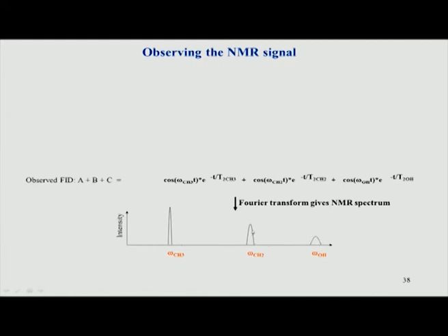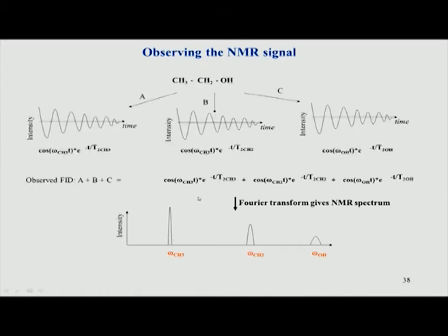And now, this one which is CH2 will be 2 times the area of this peak. So, you see the area is what is important in NMR, not just the peak height. The peak height has a different connotation. What is important is the area of the peak. So, the peak area is basically proportional to the number of hydrogens. If there are 3 hydrogens, this peak will be 3 times, let us say 3x, this is 2x, and this is x. So, 1:2:3. Area is very important in NMR, as we will see later.